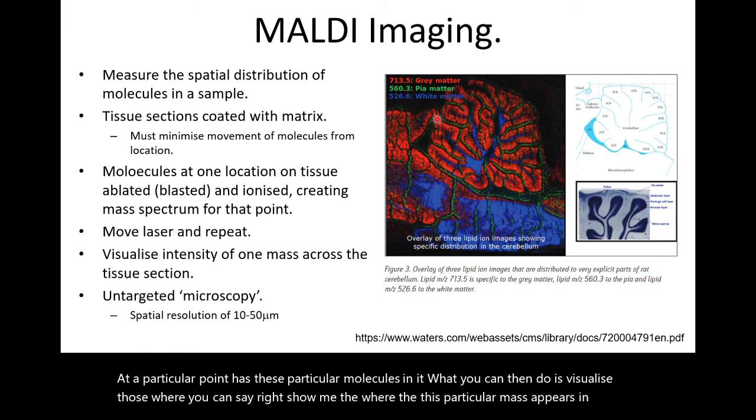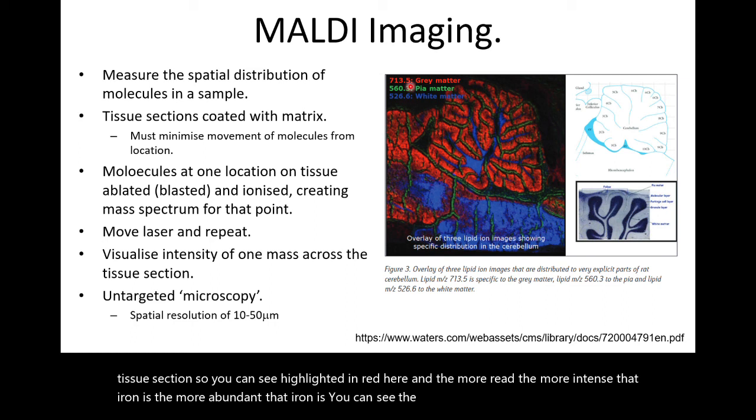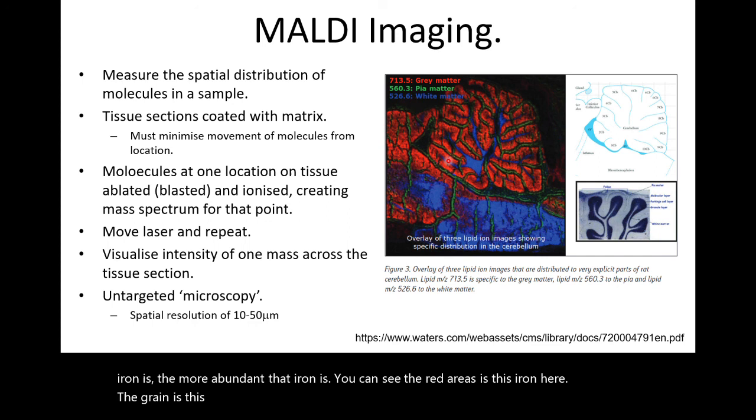So you can see highlighted in red here, and the more red, the more intense that ion is, the more abundant that ion is. You can see the red areas is this ion here. The green is this ion here. The blue is this ion here. And as I said, the more intense the color, the more the amount of the particular molecule that is there.